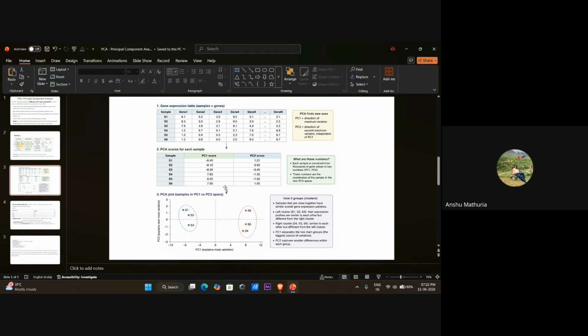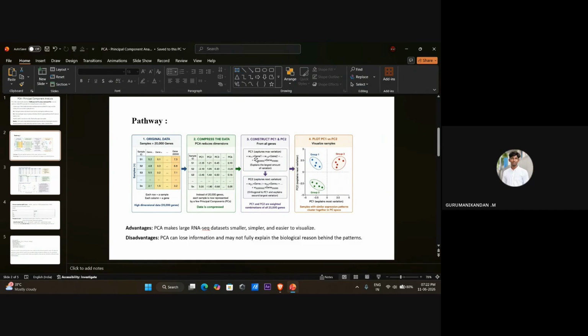I have just a few questions. Initially, you explained the entire PCA based on the RNA-seq workflow, right? Yes, ma'am. Okay. I just want to know, did you check the math that is behind PCA, like from where we are getting those variance values? Yes, ma'am. Here you can see this, ma'am, the algorithm which is used by PC1.